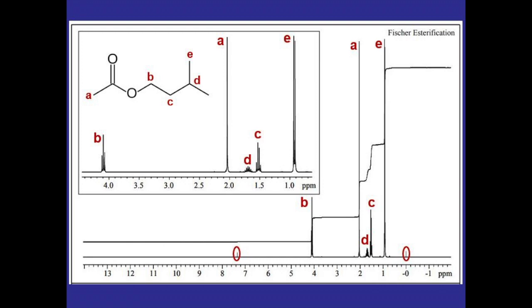The signal at 0 ppm's is being produced by tetramethylsilane or TMS, and the one at 7.3 is being produced by the solvent used, in this case chloroform or CHCl3. You'll want to have these labeled on all of your future NMR's as well.